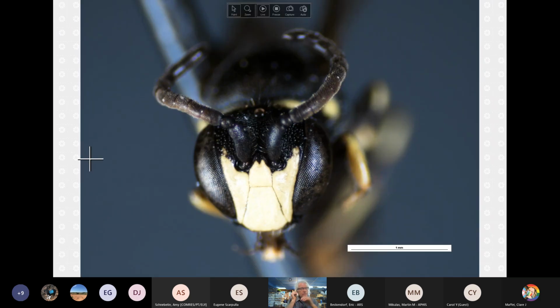There we go. So this is a very typical male, with the exception of Hylaeus, what is it? Now I'm going to forget the name of it, but that's a Western species. Hylaeus, which may have this character, but we are going to be talking Eastern species here. So Hylaeus basilis, which is an all-black bee, the male has humongous scapes.